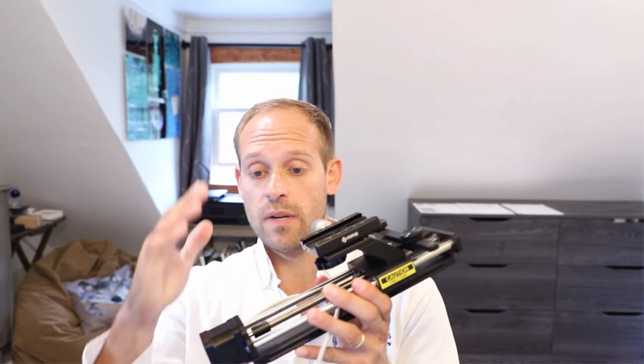Another stage type, less relevant for 3D modeling, allows you to mount the camera directly onto the stack shot — moving the camera rather than the specimen. This lets you image large slabs of rock with a 100mm lens or larger specimens like small mammals. It can also be combined with our petrographic analyzer, which functions as a backlit box with cross polarizers for looking at things like geological thin sections using cross-polarized light.